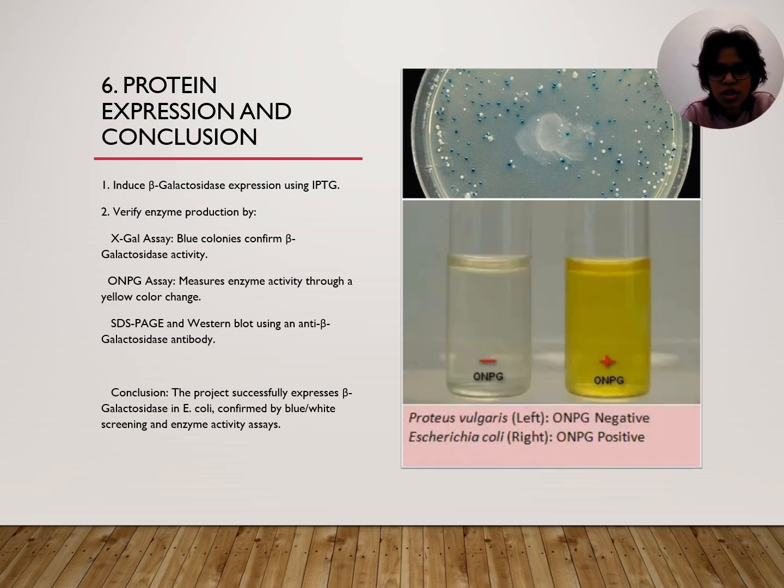And the conclusion here is, after doing all these steps, PCR and incubation, we have got the result: the project successfully expressed beta-galactosidase in E. coli, confirmed by white and blue colony screening and enzyme activity assay. I think I have done a good job. Thank you.